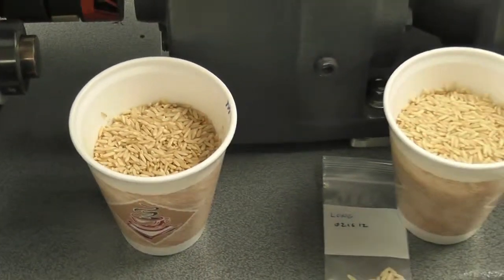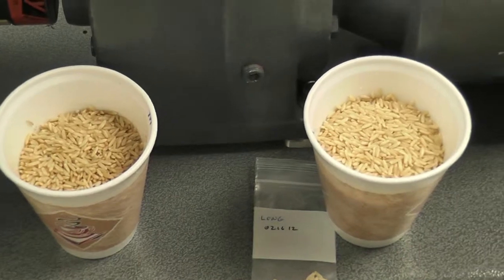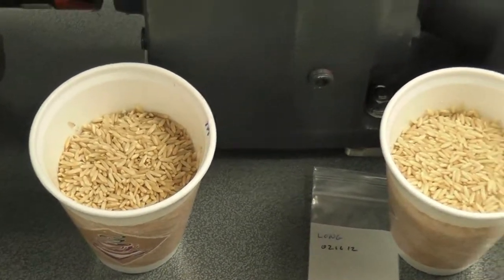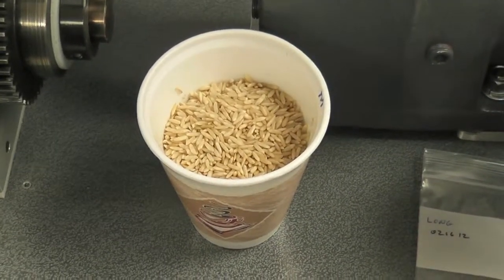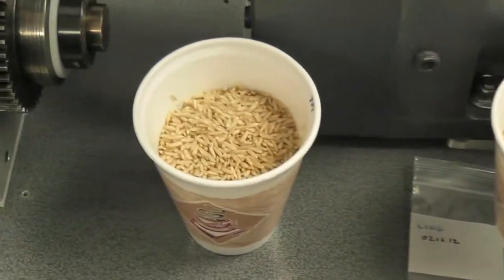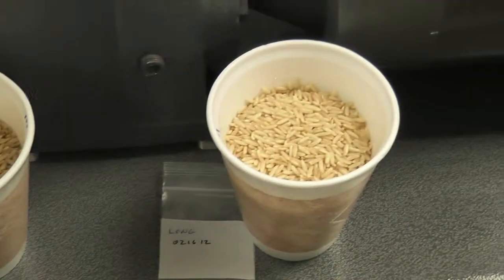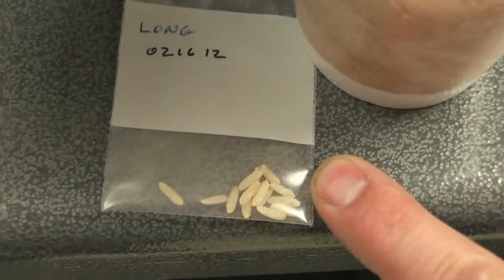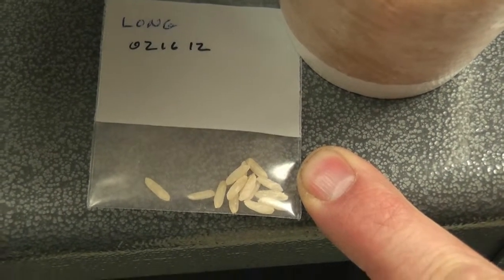We're going to do another test. Two cups of brown rice, 200 grams each. The first test we're going to run is this cup — there are no insects in the rice in either of these cups. The second test will use this cup and we're going to add kernels that we have x-rayed and confirmed to have medium-sized lesser grain borer larvae inside.